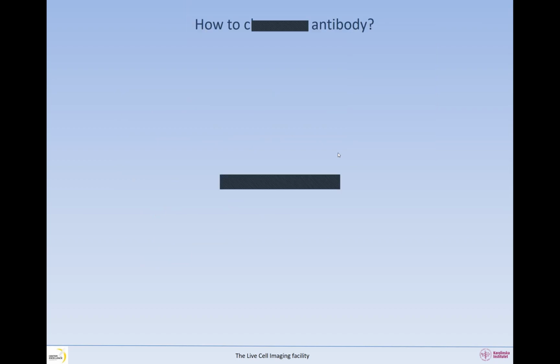Just continue. Oh, okay. So how do we choose an antibody? Can everyone hear me? Yes.